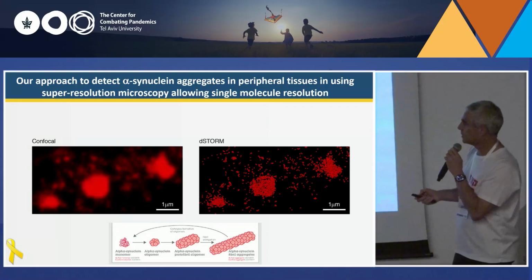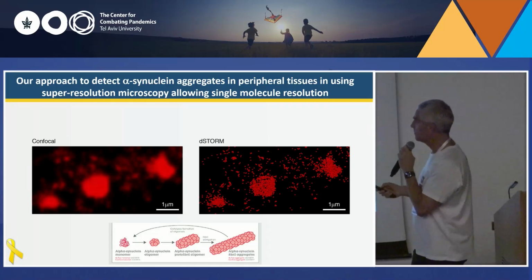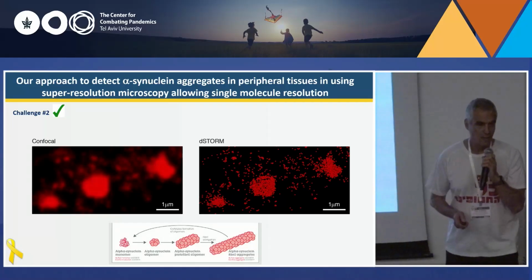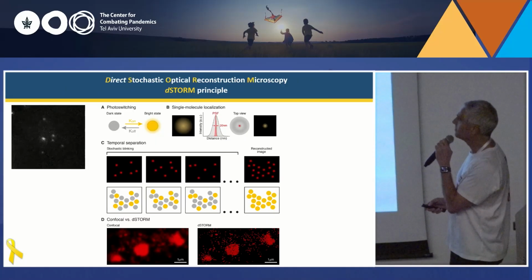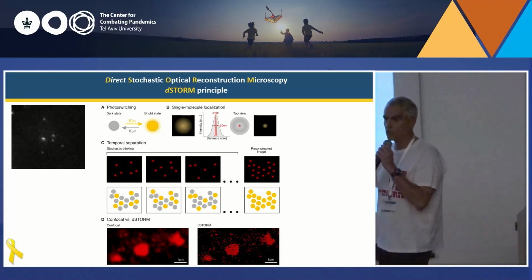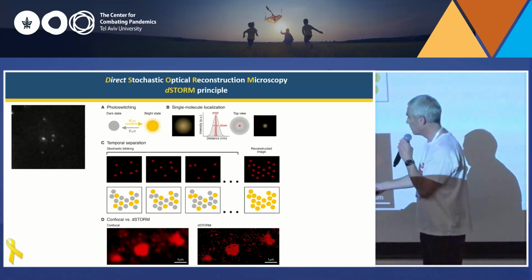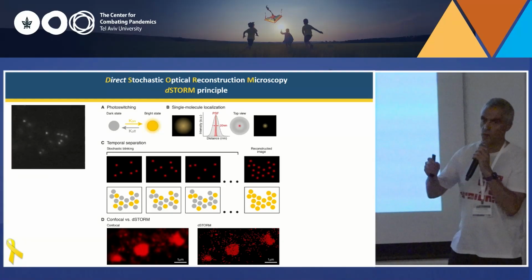So how do we do it, or how does the system do it? We're using a microscope that exists in, I think it's now called, the Gray Imaging Center in the medical center. Because of the fluorophores, instead of all of them shining together and giving us a very blurry image, we cause them to blink stochastically.